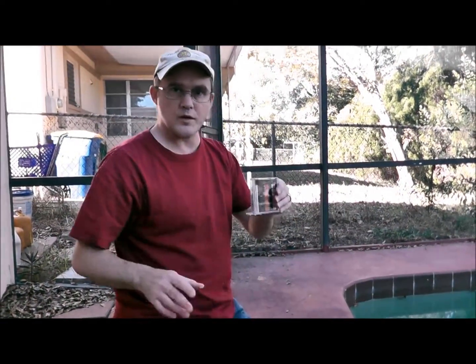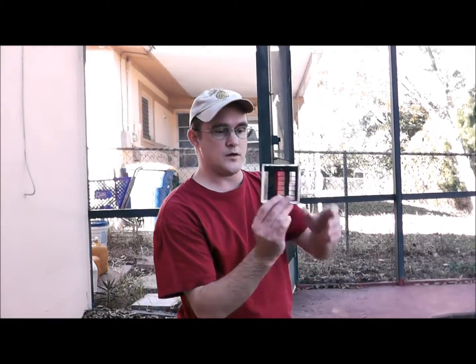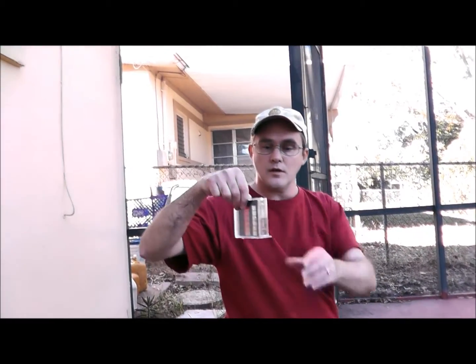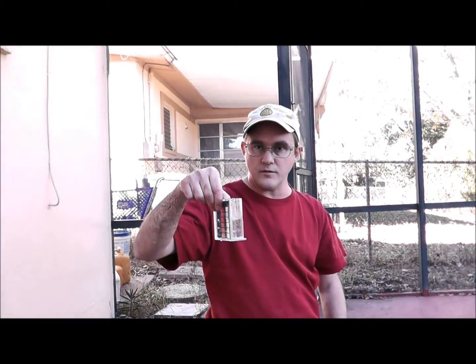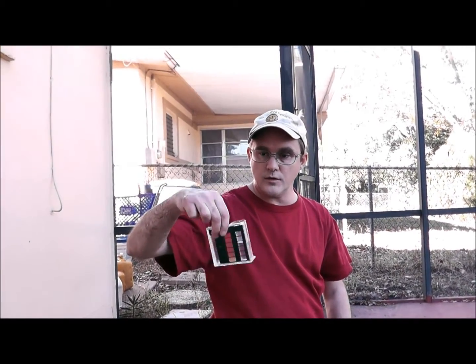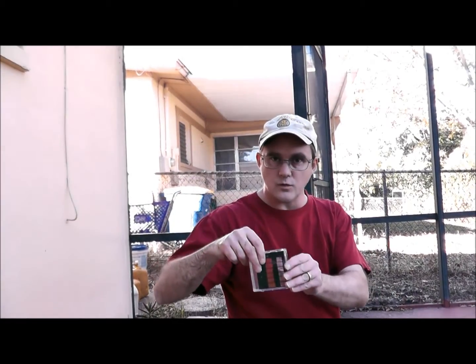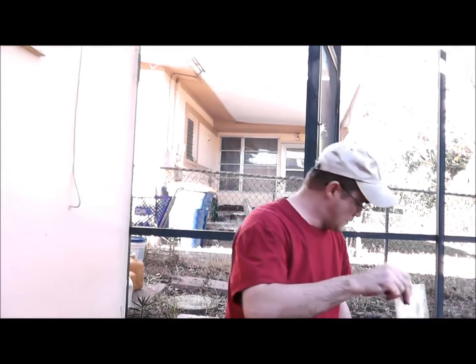When you swirl, do not hold it like this and slosh it around — that does nothing. Also don't hold it up and just go back and forth — that does nothing either. What you want to do is get that nice circular motion going. That's a good swirl.